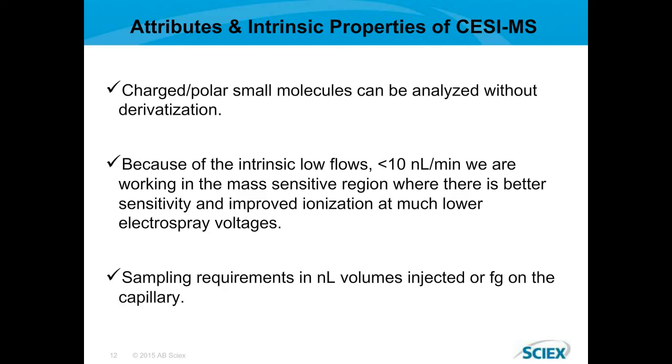The sampling requirements in CE are extremely low. We're talking about nanoliter volumes injected, which corresponds to low femtograms on the capillary, and that is, of course, before it gets into the mass spec. It's difficult to estimate how much actually gets into the mass spec, of course.